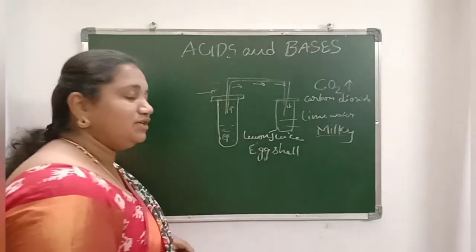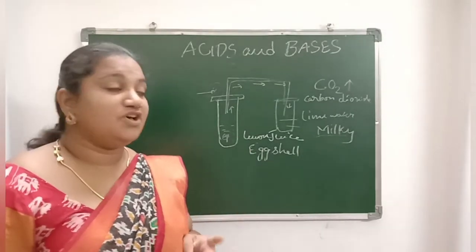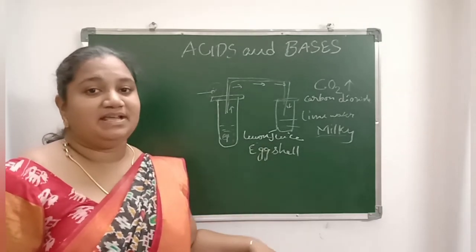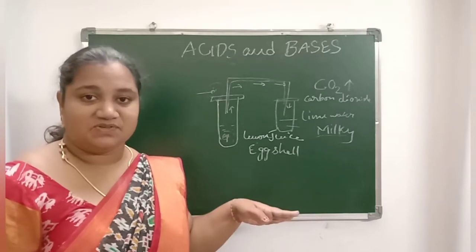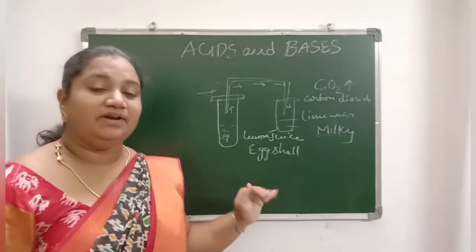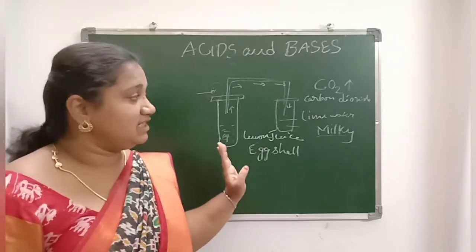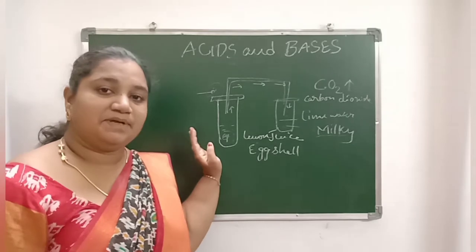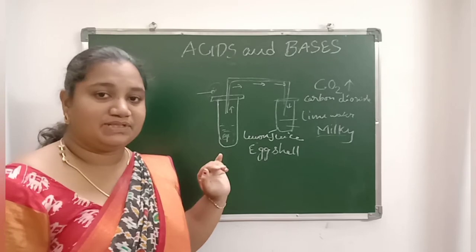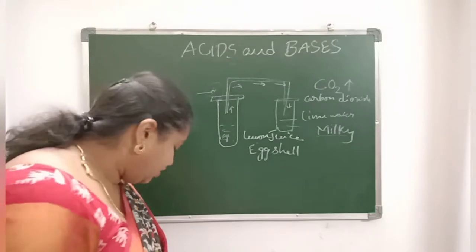In this lesson, you have learned about many activities and experiments: using natural indicators to find acids and bases, using lab prepared indicators to find acids, bases and neutral substances, and adding litmus papers to substances to find acids, bases and neutral substances. You have the tables and have completed all of them, I think. This is the second experiment, which explains CO2 gas, and the first experiment describes hydrogen gas. Now you are going to learn about neutralization.